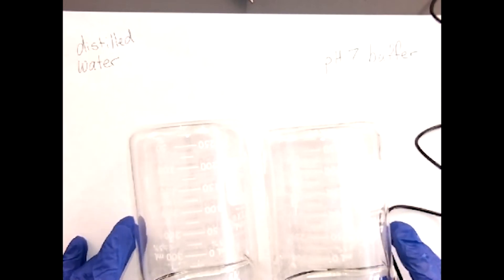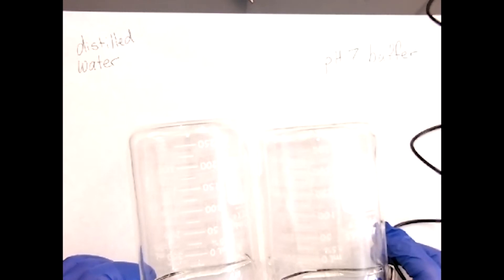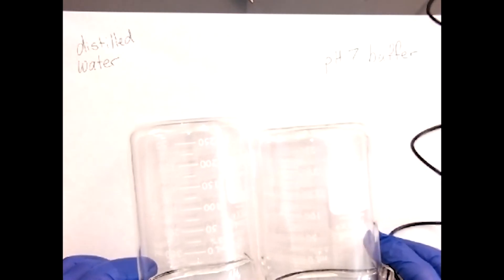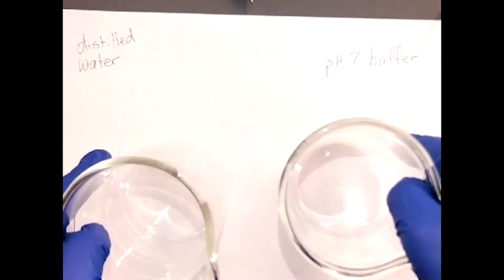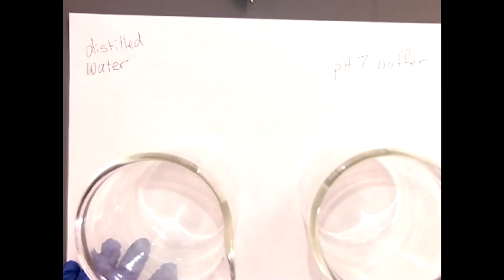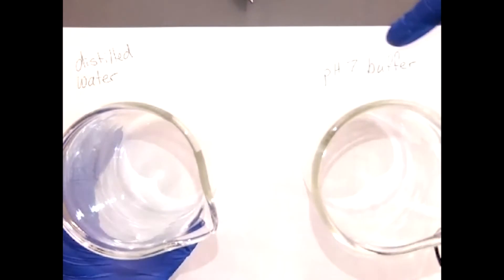We are starting on step three: investigate the effect of a buffer on pH as follows. Place 25 milliliters of distilled water, which has a pH of 7, and buffer solution, which also has a pH of 7, in separate labeled beakers. Here we have our two beakers, and I'm labeling them by just putting them on the sheet of paper with the writing.